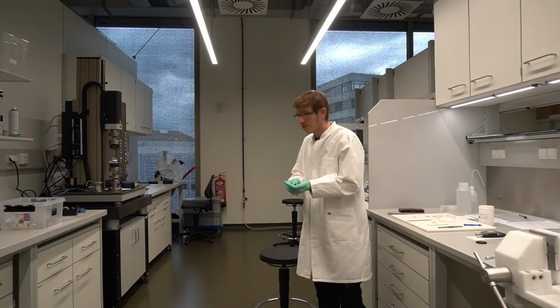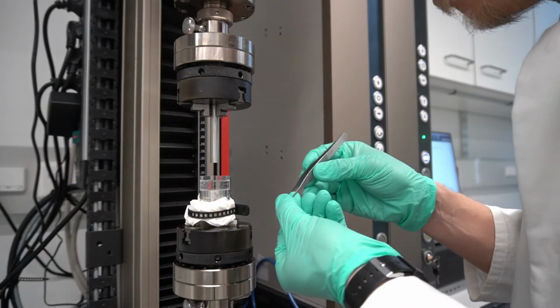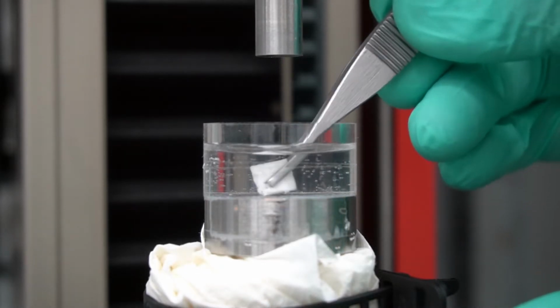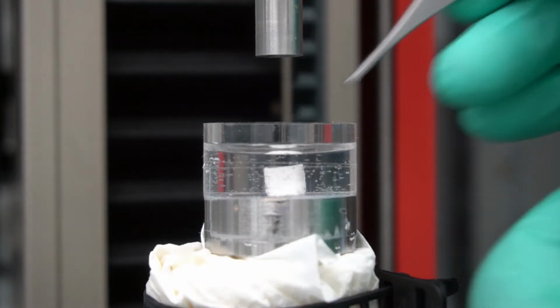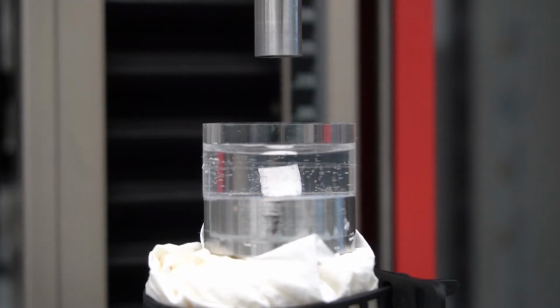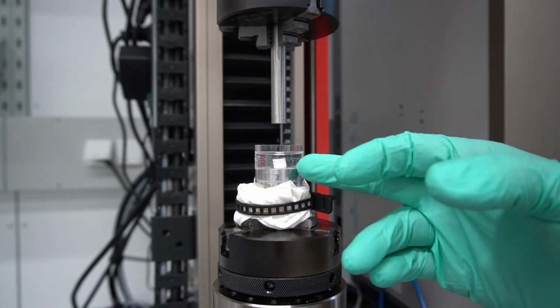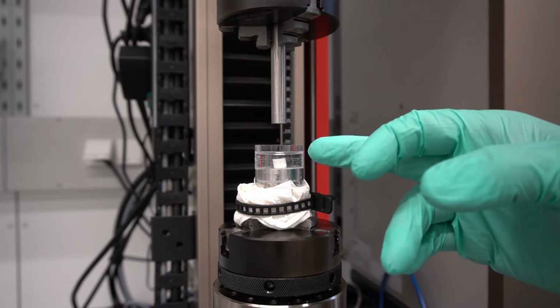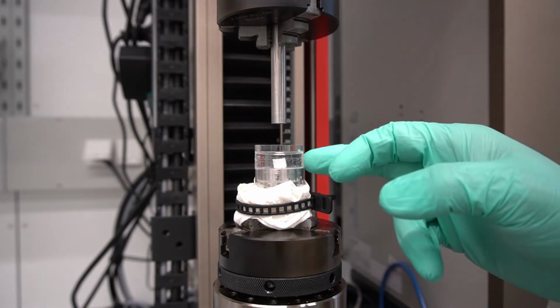So let's take the sample to the machine. So I'm putting a sample in the test setup, and try to center it. Okay, what is the test setup doing? The test setup consists of two pieces. One is this bath here. It's filled with saline solution. It has a flat bottom, and the sample is put just on the bottom of this container.